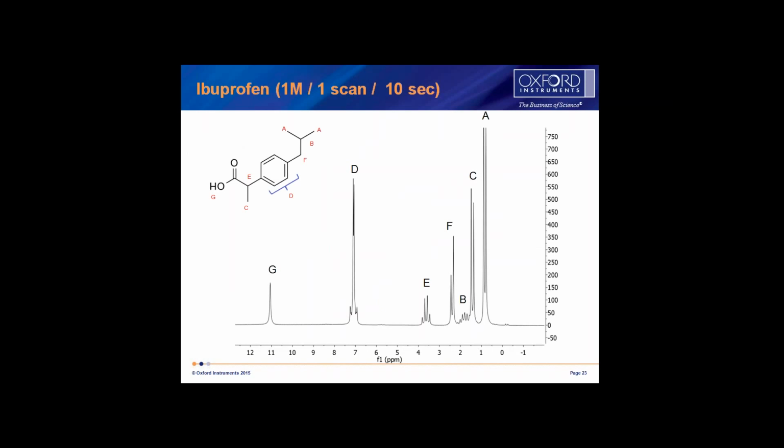Again, it's quite a nice spectrum, but I'll draw your attention to spin B. Spin B sits in between two CH3s at A, so that's at least 6 hydrogens that are going to split the signal, and a CH2 at F, so that's 8 hydrogens splitting the signal. What we can see is it forms a multiplet partially obscured by C, and because of all the splittings, the amplitude is being greatly decreased. So here we have an excellent example of the kind of overlap that we might see.